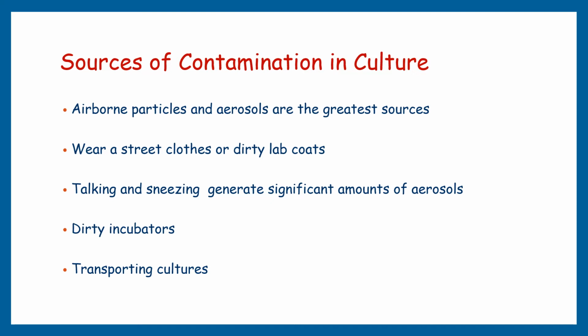The fans used in many incubators to circulate the air and prevent temperature stratification can then spread these spores and other particulates. Some incubators humidify incoming gases by bubbling them through water reservoirs at the bottom of the incubator. The aerosols generated by this will quickly spread any contaminants in the water.